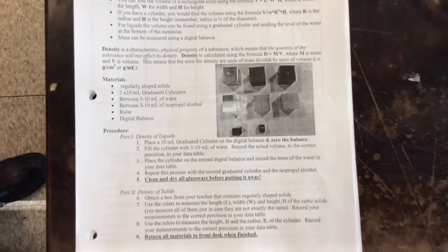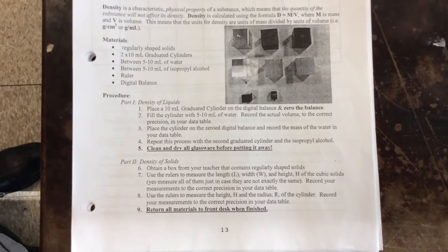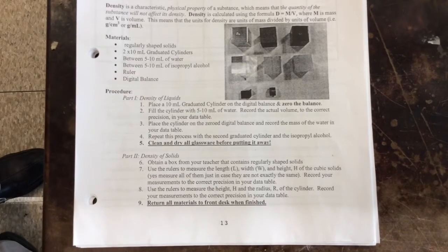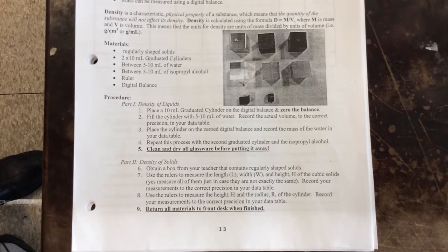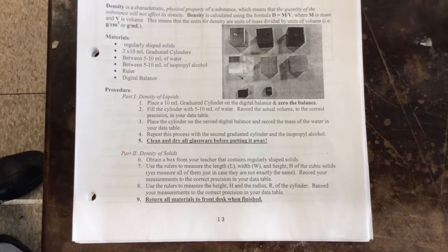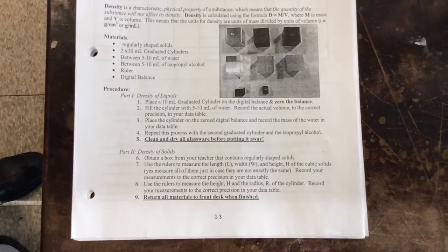Density is a characteristic physical property, and each object that we have will have a different density. You will also have an unknown. This unknown will be a smaller cube in the blue box with all of the other items. The small cube is made out of the same material as one of the larger cubes, and you're going to use density to try to figure out which one it matches up with.